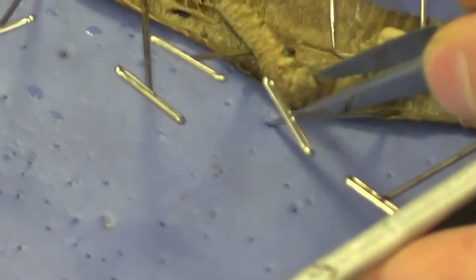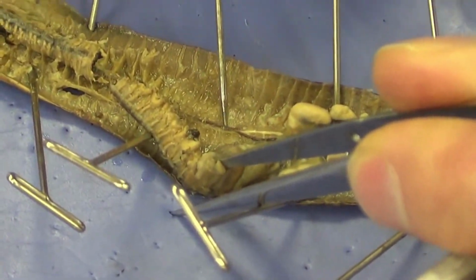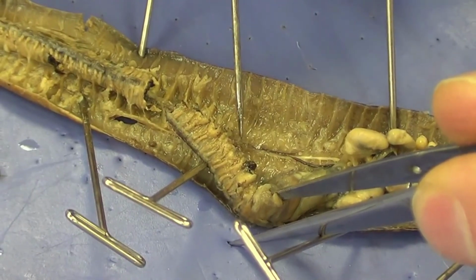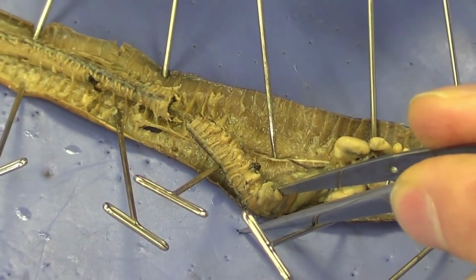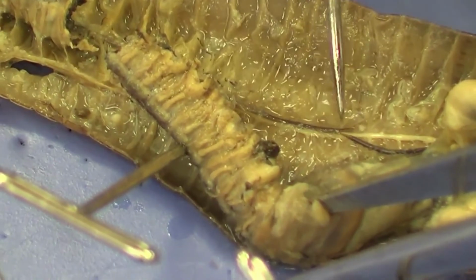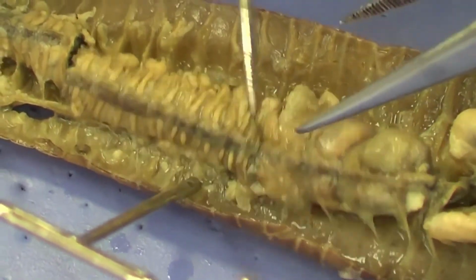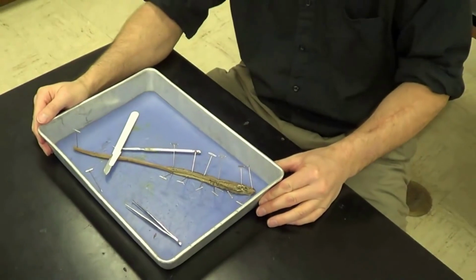And then along with it, you can see this very small black fiber running along with it. You can see it right there. You can see it right in through here. Try to clean that up just a little bit. That is going to be the ventral blood vessel. And that's going to run with the nerve cord. And you should know that. And that's going to be it for the earthworm dissection.